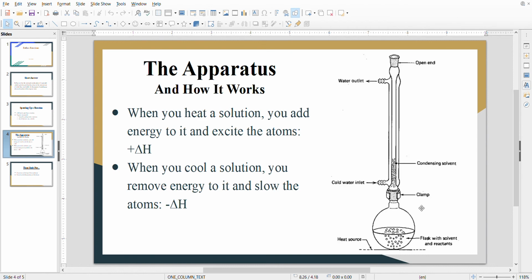And again, this is also so that chemical reactions that might take place within the solution can occur faster, because chemical reactions occur faster at higher temperatures because all the particles in the solution are interacting far more frequently.